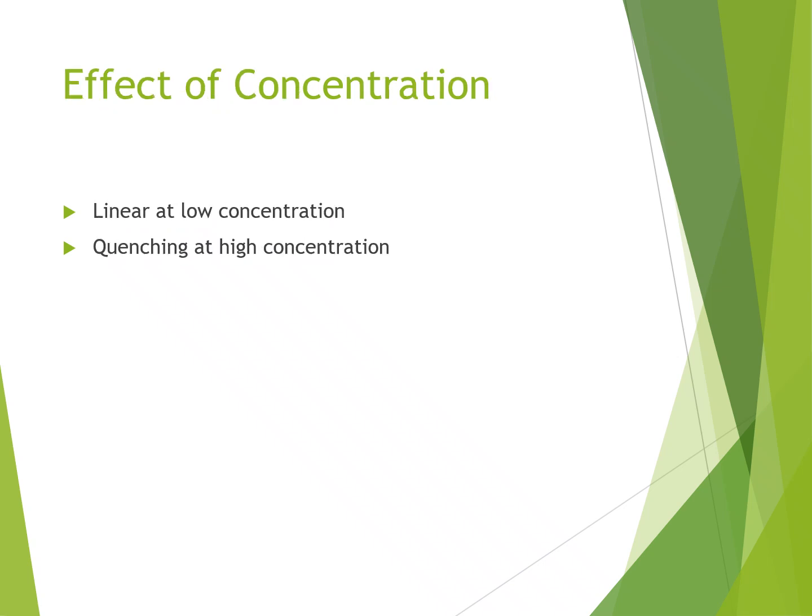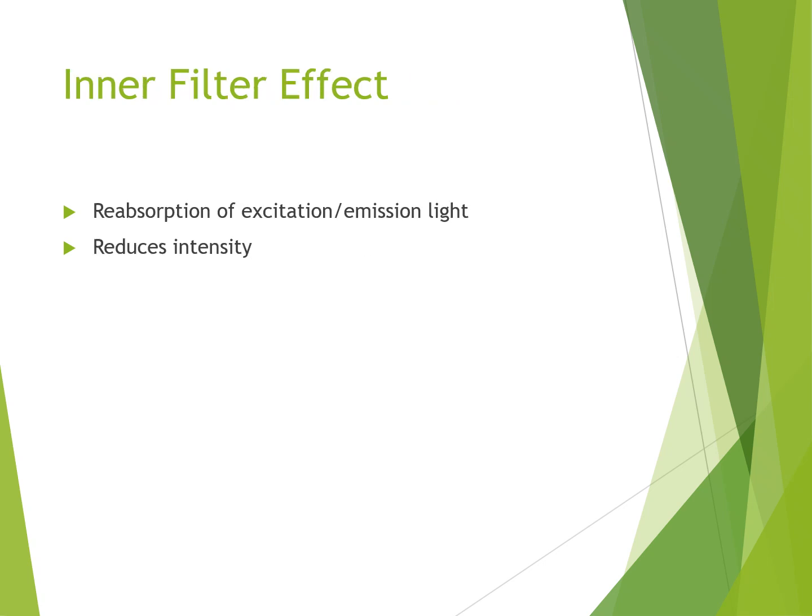At low concentration, fluorescence intensity is proportional to the concentration, and at high concentration, quenching occurs. So at low concentration, fluorescence is very useful to detect. The fluorescence technique is very useful to identify trace, very minute concentrations. The effect of concentration is very important in fluorescence spectroscopy.